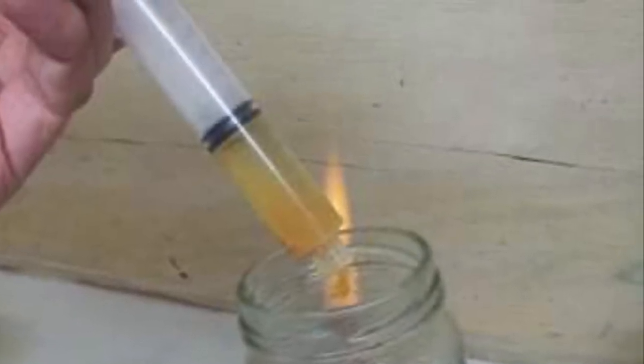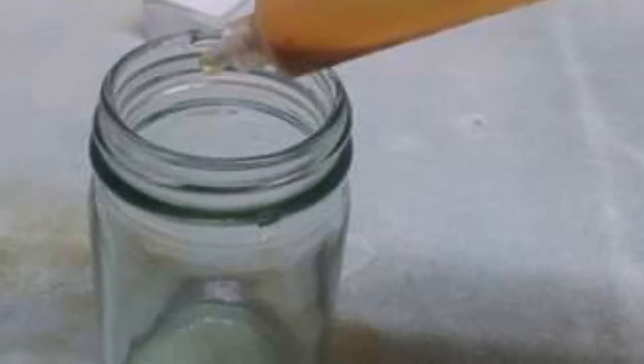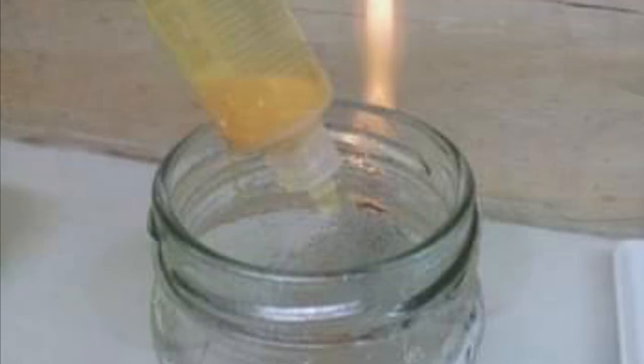A sterile syringe may be used to pick up the seeds from the mini canister. Seeds may be washed with sterile water prior to planting. A small piece of sterile cotton plug prevents the seeds from escaping into the bin. A few drops of liquid carrying the seeds may be syringed into the medium after the sterile cotton plug is dislodged off the tip of the syringe.